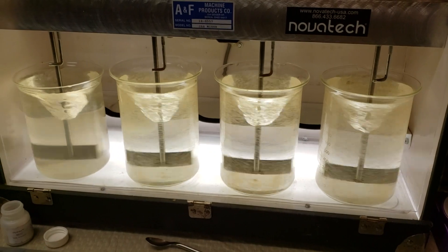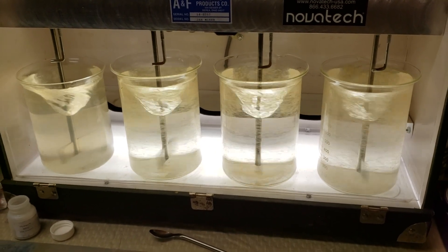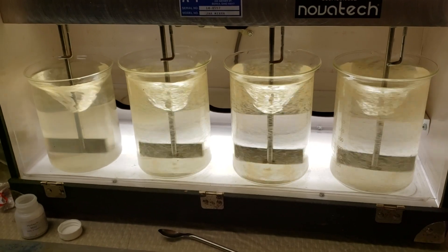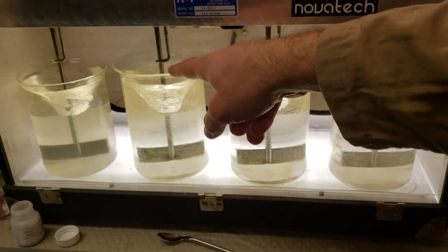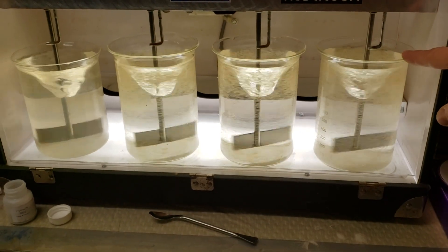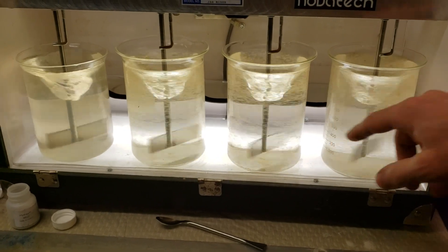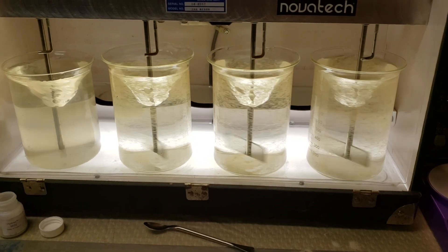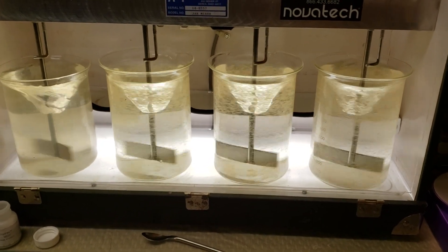All right, we're doing some jar testing today on the Lake Thomas water. The jar on the left is untreated, then we've got 5, 10, 15 ppm of coagulant, 1 ppm of flocculant, and about 8 grams of sand in the three jars to the right.